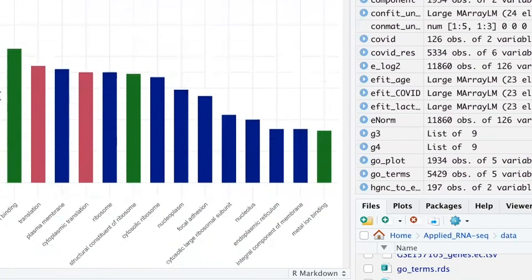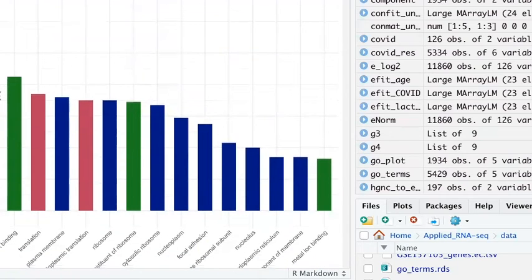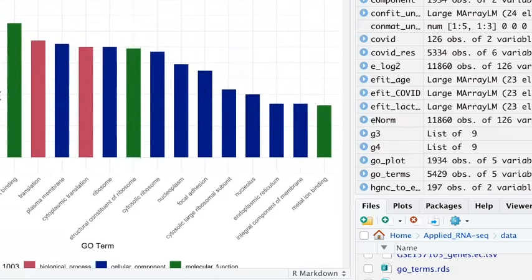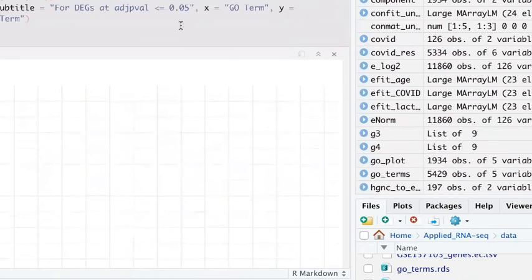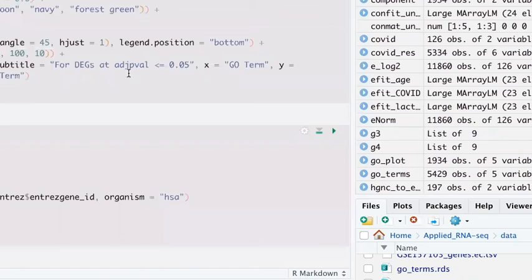Yeah, so this is kind of what you get. So this was just a few basic steps to show how you can better your plots and just display them according to however you would want. Again, be very careful of using GO terms. And then this is the last step. So 140, we're doing good.